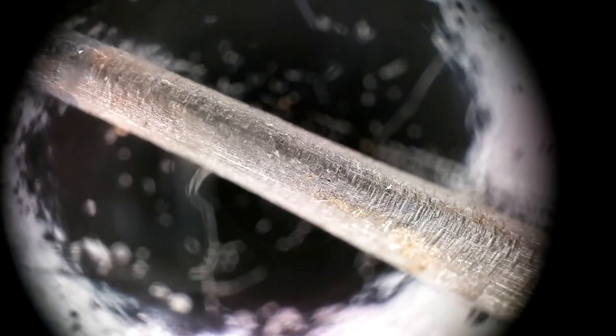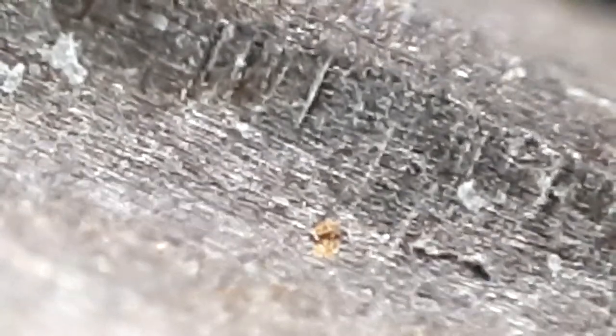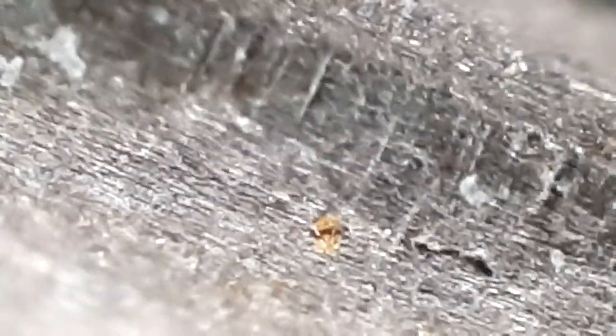Seems to be these kind of like spots here. There's one there. See if I can locate that better, just to the bottom. Okay, right in the center of this frame is something that looks like a spot with an area around it. It's a distinctly different color, kind of coppery color.